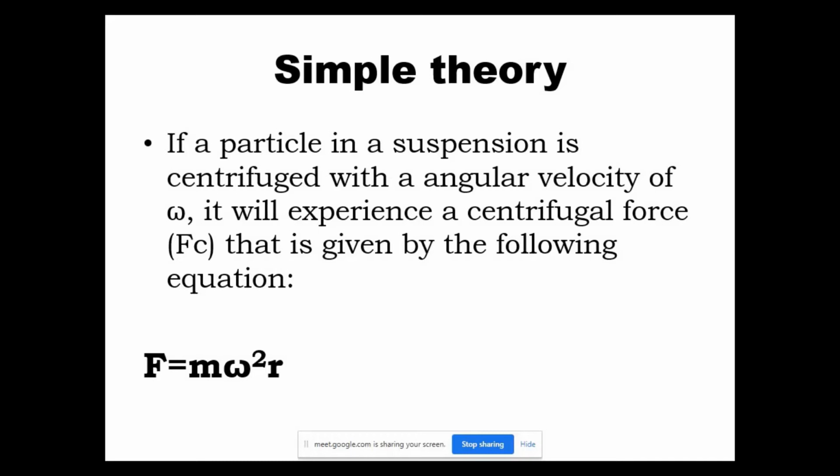If you go back to your school days knowledge about centrifugal force, there are two types of forces that act on circular motions once you rotate something. One is the centrifugal force, and the second is the centripetal force.